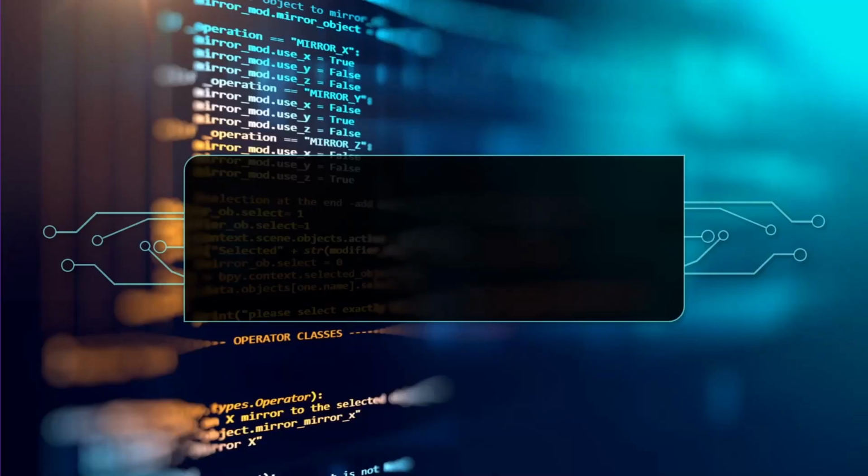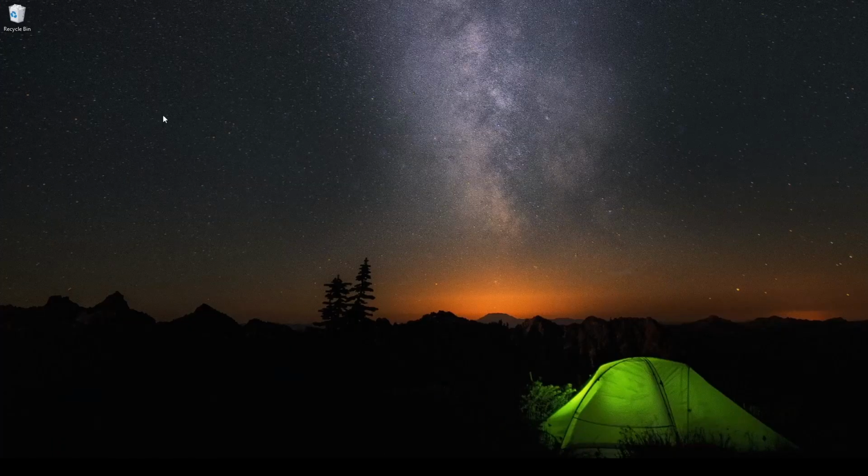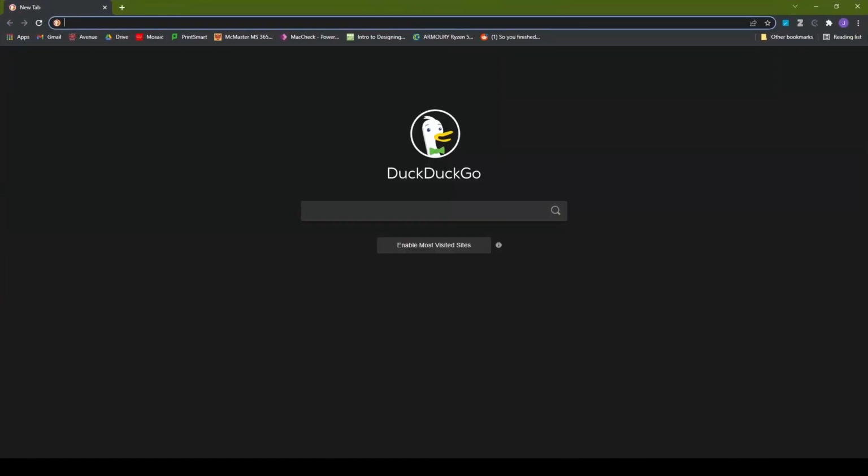So to get started, I'm going to ask you to first download some files that we've created here, as well as the data set that we're going to use. So let me stop sharing my screen, and I will bring up Google here.